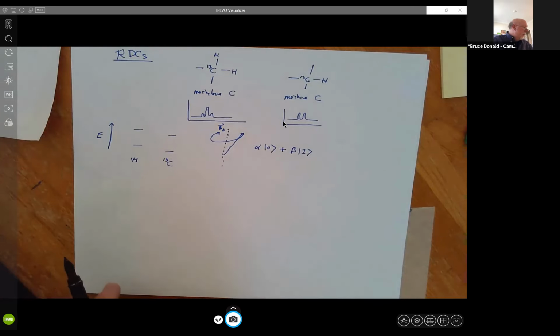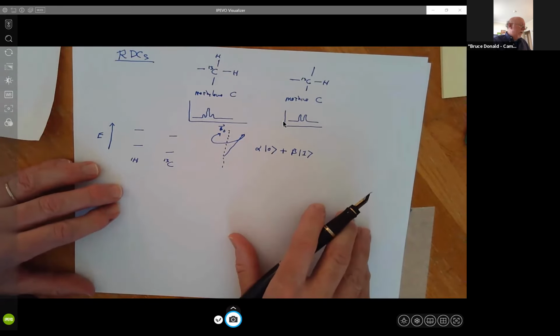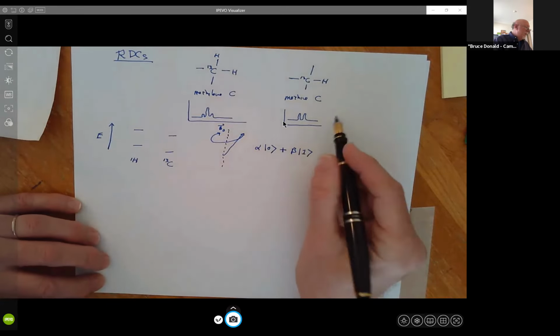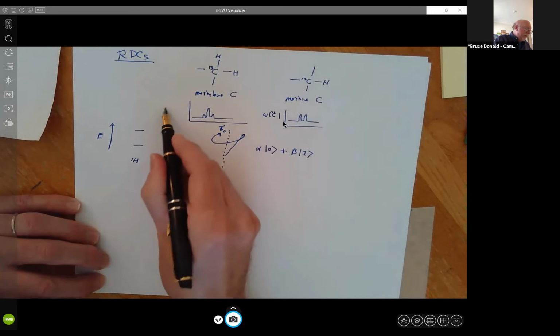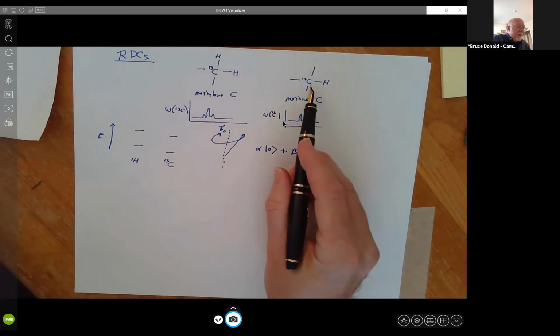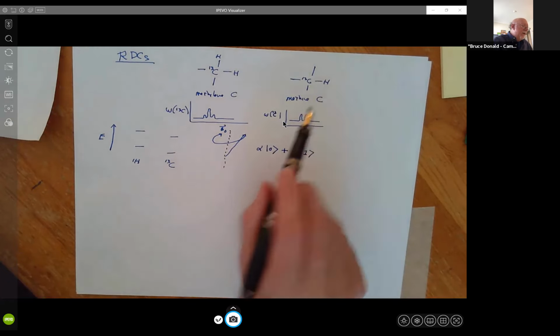The basic way we can think about it, in this pre-theoretical way that we're developing this material, is that here we're looking at the C13 spectrums. This is omega C13. This is omega C13. The C13 resonance is split by having the attached proton into 2.